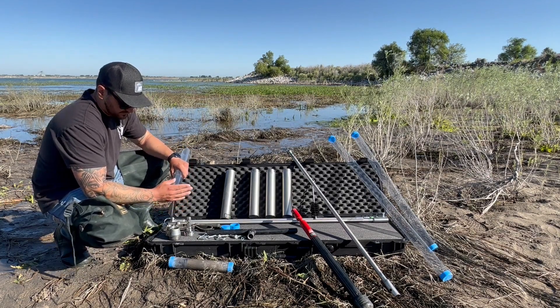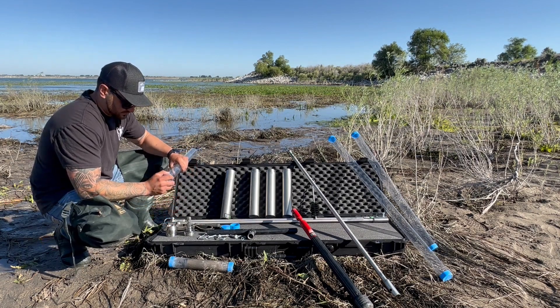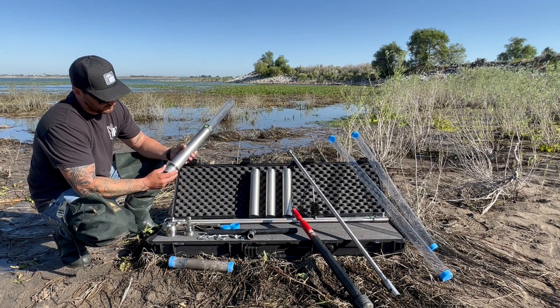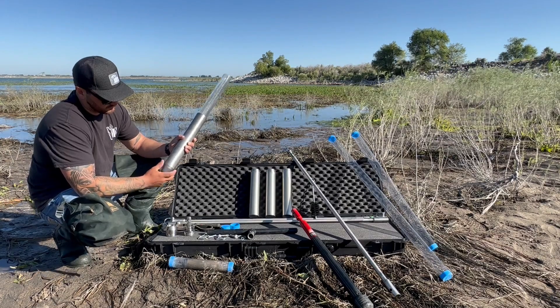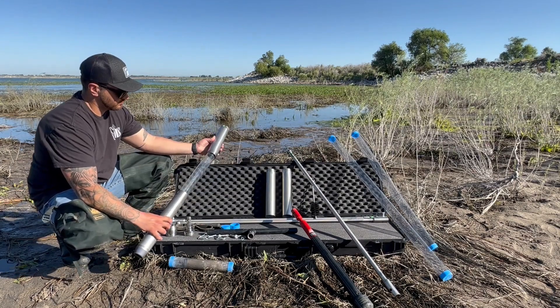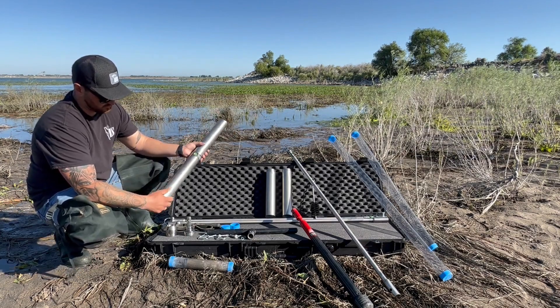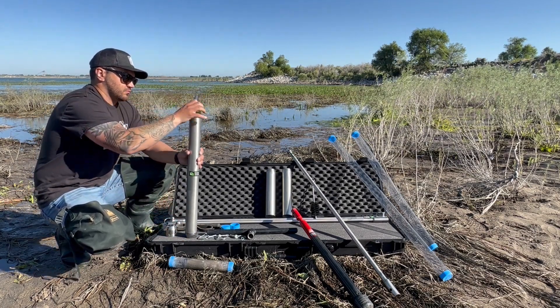To retrieve a larger sample, simply repeat the previous steps with a few additional ones. Once the sampler base is securely fastened to the tip, thread an extension section to the sampler base. Complete your sampler by securely threading the flat valve cap to the sampler base.